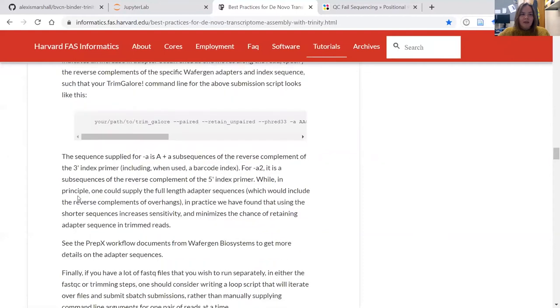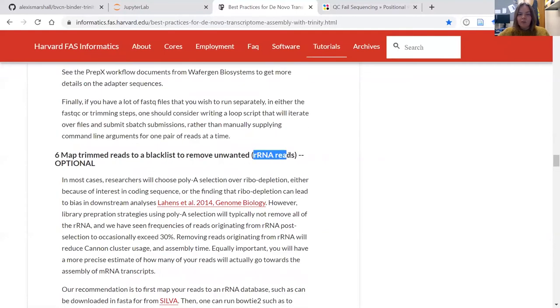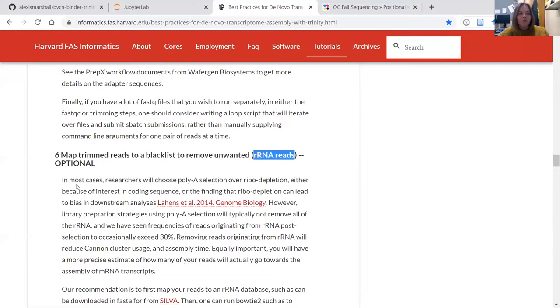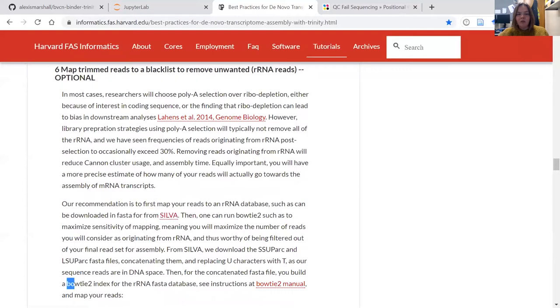We then identify ribosomal RNA reads. This tutorial assumes you want to remove these because a lot of RNA library preparation kits have a ribosomal RNA depletion step or a poly-A enrichment step. Carrying over ribosomal RNA reads into an assembly means the assembler takes a lot longer and they're unwanted. The blog uses the SILVA database and Bowtie2 for this, but today's tutorial uses SortMeRNA. Both approaches are valid. We're using SortMeRNA because the BVCN has previously provided a tutorial on it.